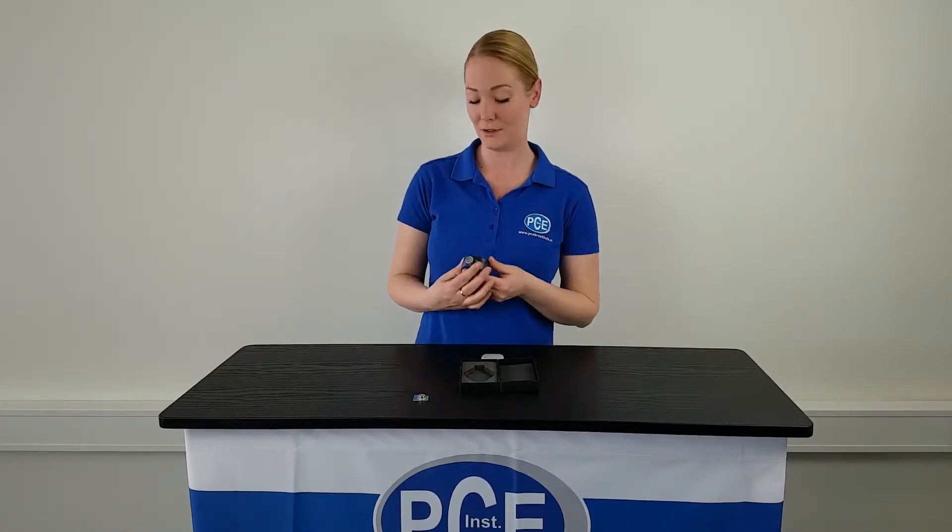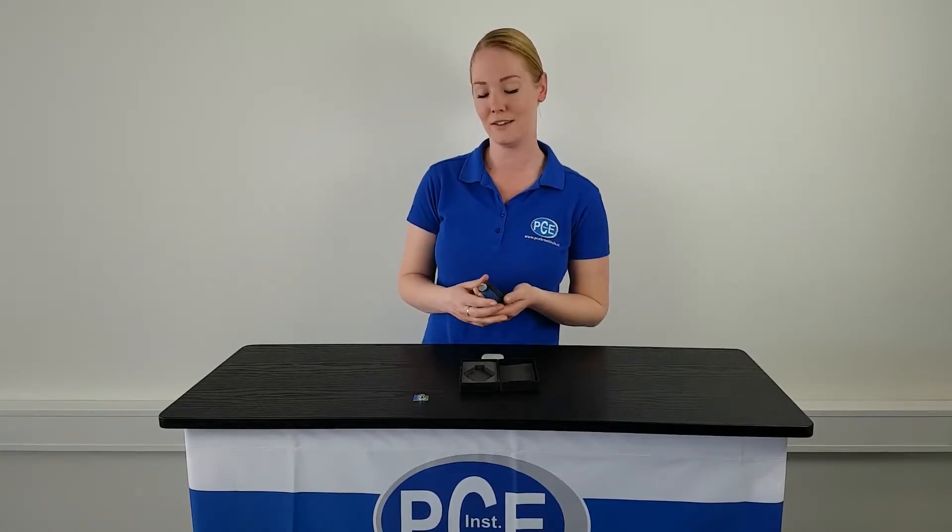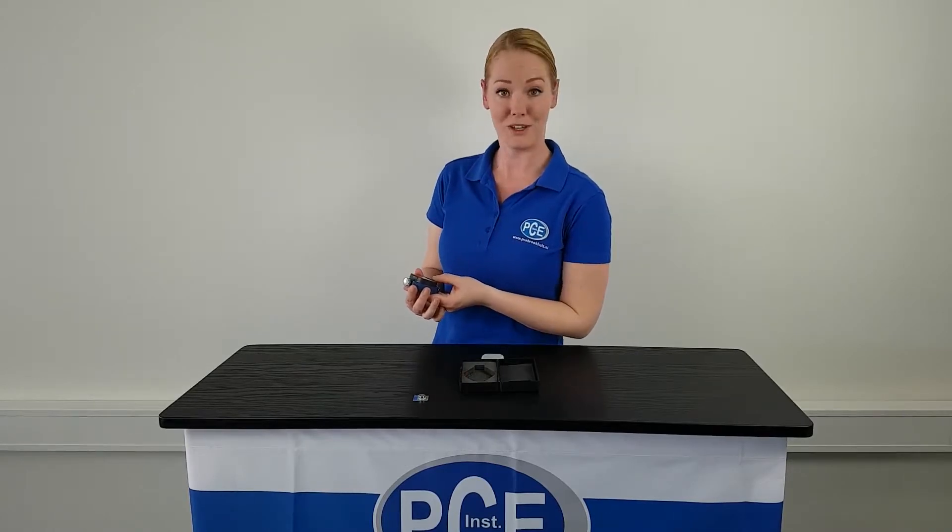This measuring device makes it possible for you to quickly and easily test the shore hardness. It is suitable for soft materials like soft rubber, rubber, and elastomerics.